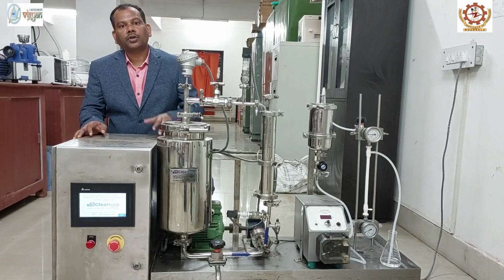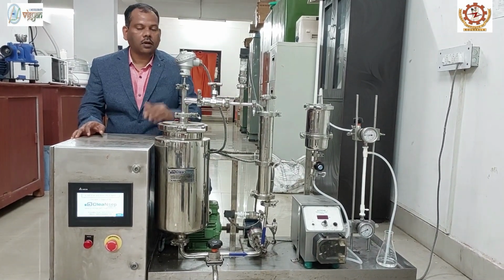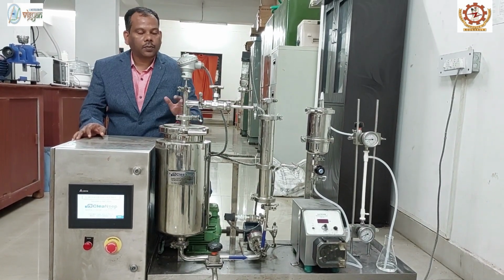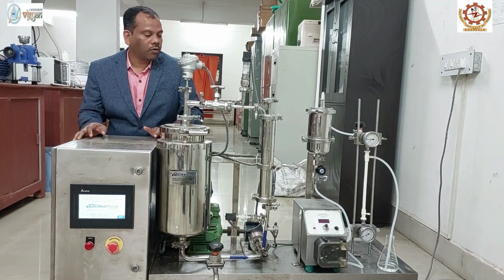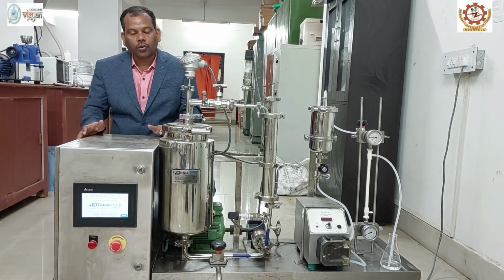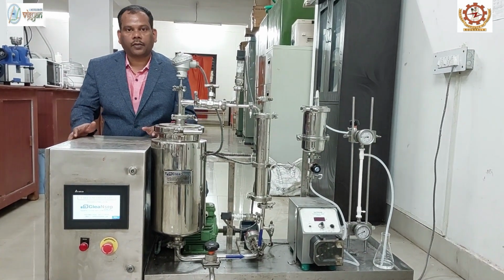We'll demonstrate the detailed components and the working principle of this membrane filtration unit. All of this we will show you practically with the help of this class.